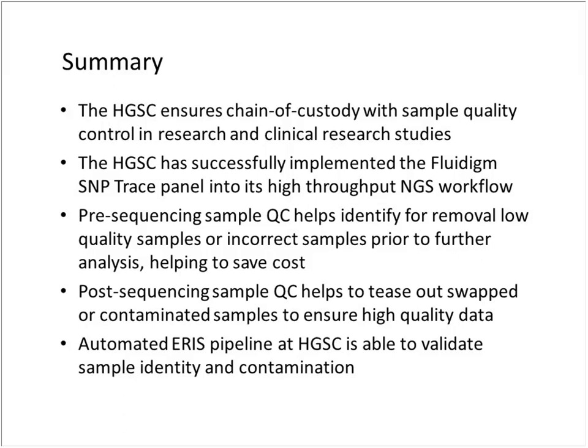Our HGSC developed automated ERIS pipeline is able to validate sample identity and contamination.